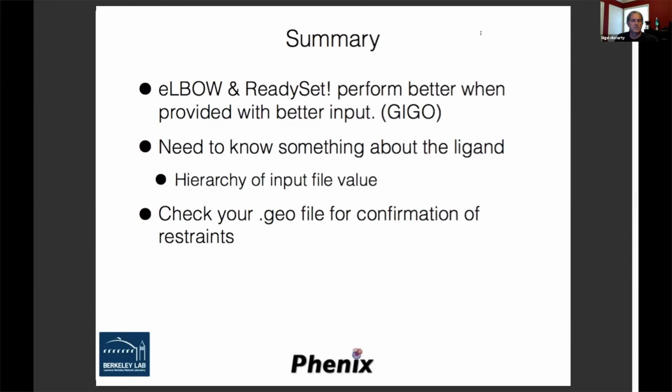There's also the other thing for Elbow, that not all of the three-letter code restraints are shipped with Phenix. So you do have to use it occasionally to create those three-letter restraints. So yeah, if you have Mogul there as well, you can either use it to create the restraints, or you can use Mogul to validate them.